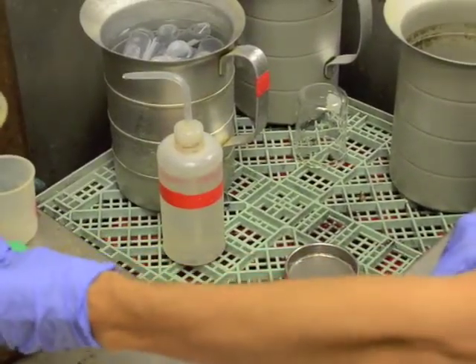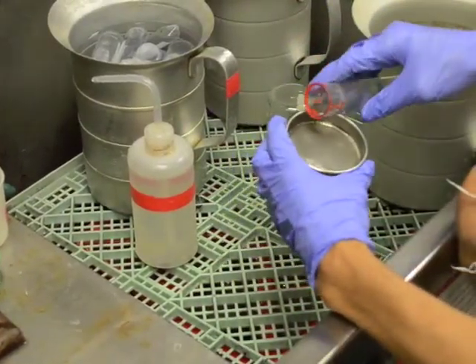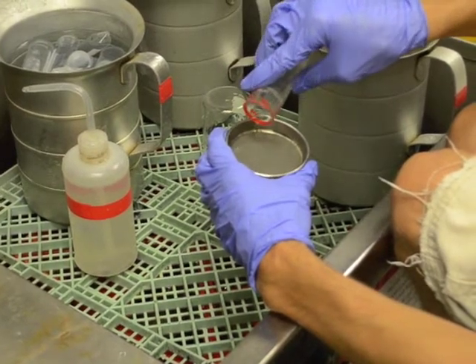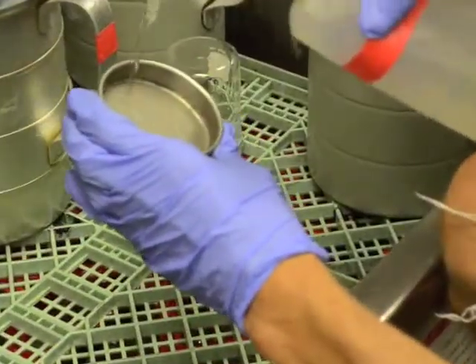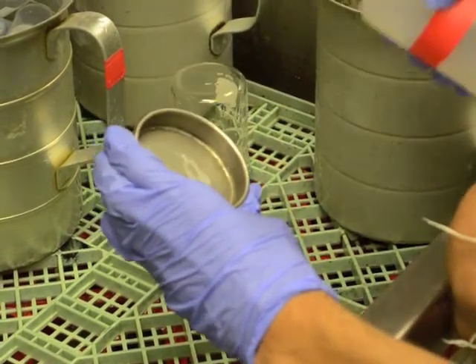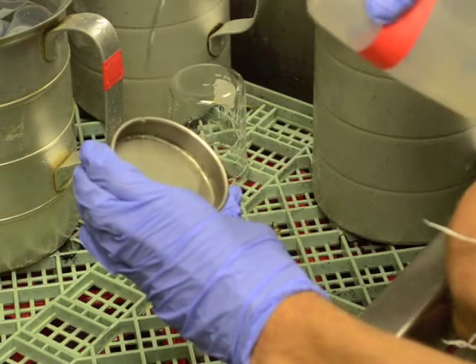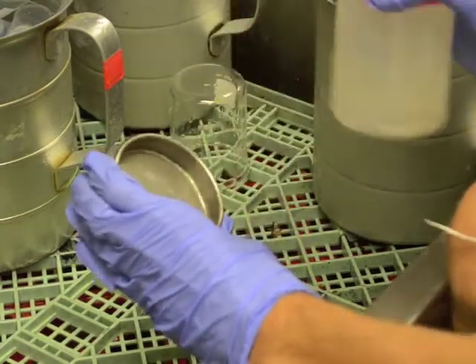After the second centrifugation, pour the contents of the tube onto a wettened 500 mesh sieve. Rinse away any excess sugar water. At the end of the process, you should see a fine line of eggs at the bottom of the sieve. Transfer the contents of the small sieve into a wettened 50 ml tube.